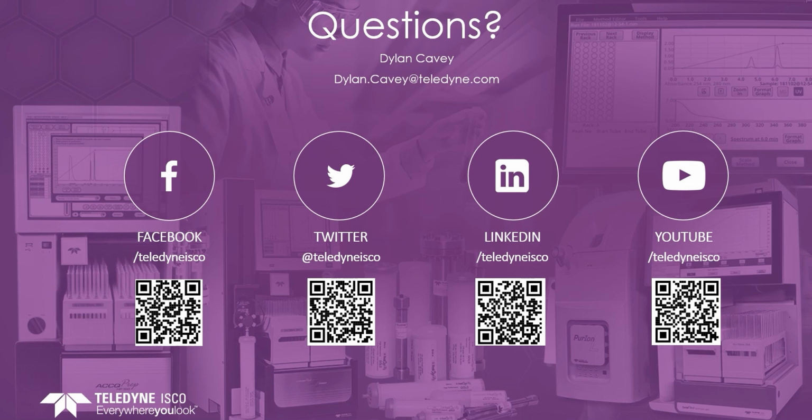You could also look into using solid loading if you're not seeing the separation you want with the solvents and stationary phases that you have at your disposal. Maybe look into running solid loading. And the last option I could give you is to use the Focus Gradient Generator. See what separation you get with that generated gradient. Maybe you will get the separation you're looking for.